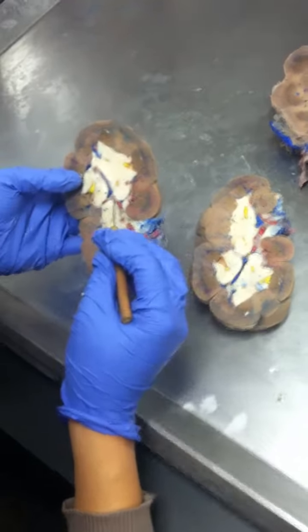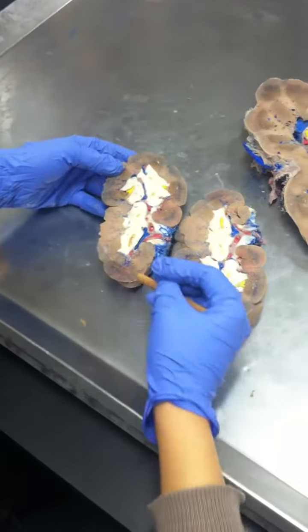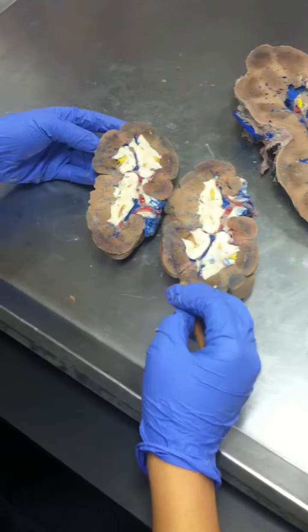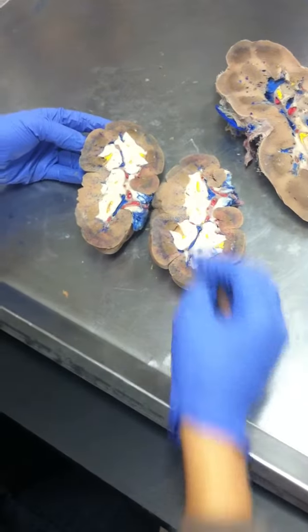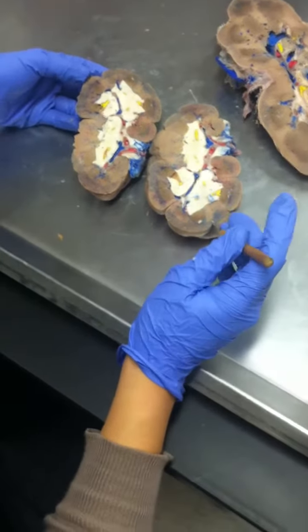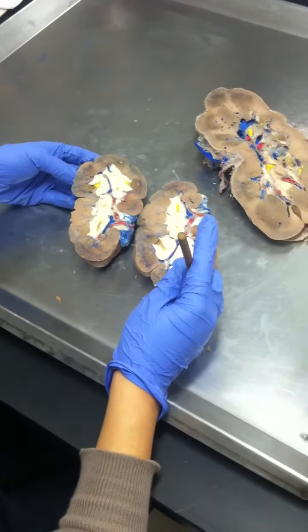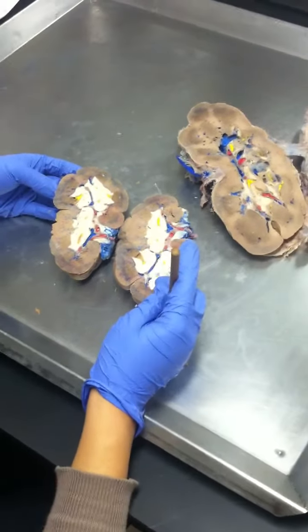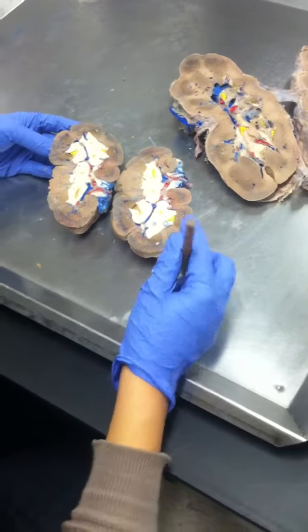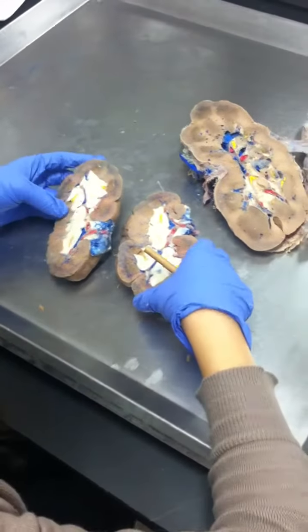Well, you can see the blood vessels on the outside of the kidneys, right? You sort of see the blood vessels here. See that? There are small dots of red and blue on the outside, in the cortex. Those blood vessels are called the arcuate arteries and veins, right? And those provide blood to the glomerulus. So remember, we have the glomerulus in the cortex, right? So all the arcuate arteries and veins go towards that structure. And so you can sort of see it here, arcuate arteries and veins. All right, fantastic.